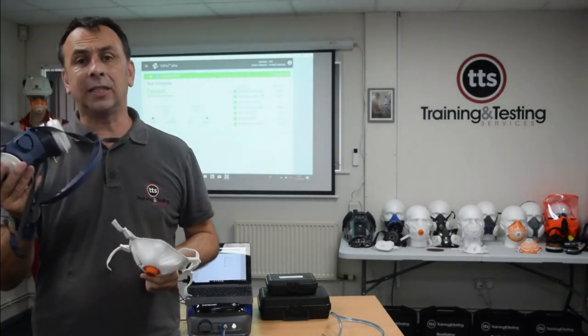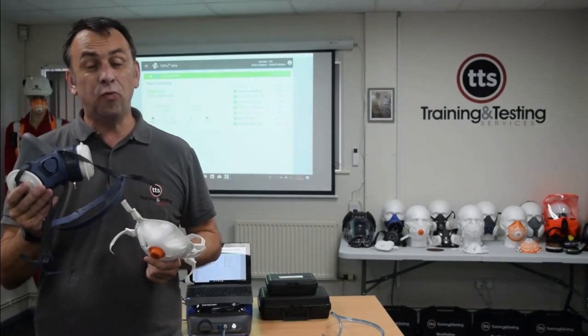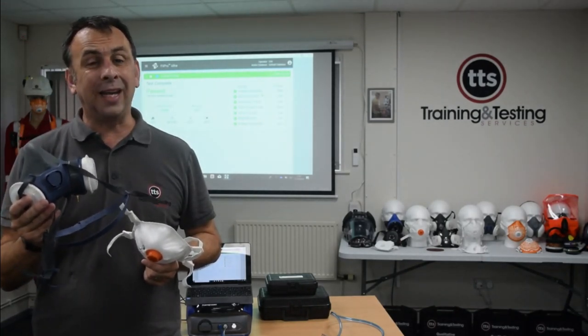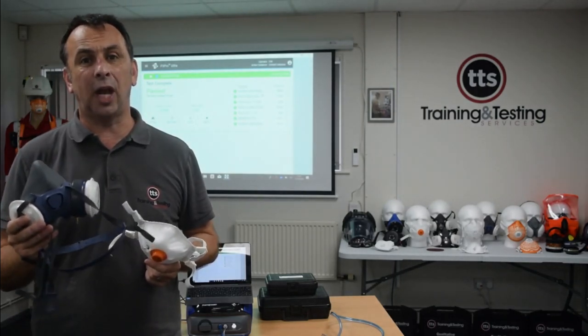When we look at the Moldex 7000, again, when we look at what the original fit factor was, it did really well. It was over 4,500. But second time around, again, we nearly tripled that level of protection simply by having a shave.